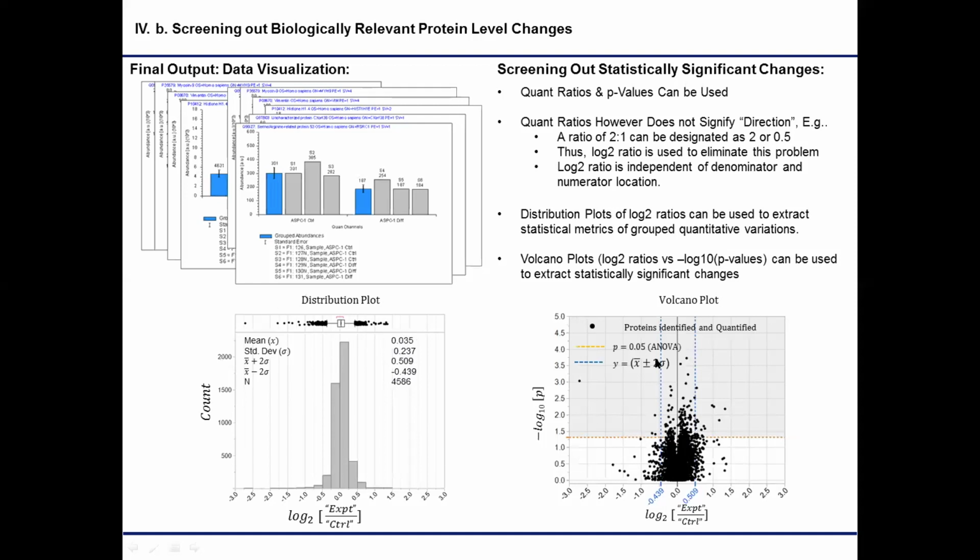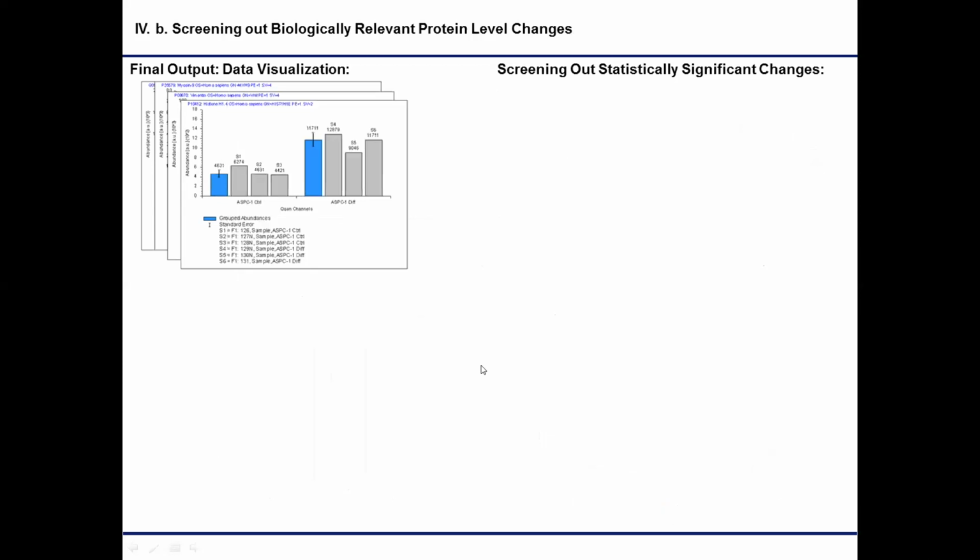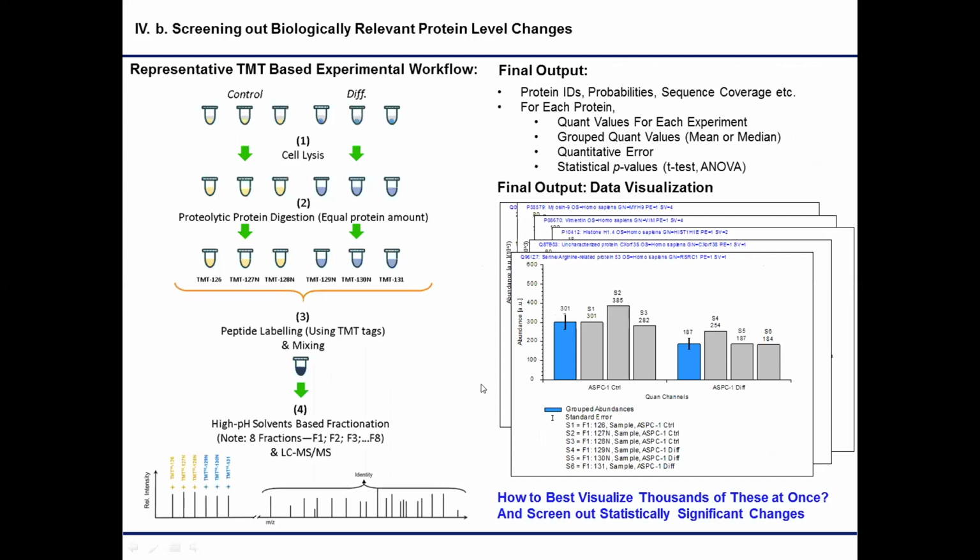And then what is the mean plus or minus 2 sigma? What does that give you from a statistics perspective? Yes, so from a statistics perspective, what it means is that in the experimental sample, these proteins basically have lower abundance. I'll try to get an example where I have it here. You can also say it gives you a confidence interval. Yes, exactly.